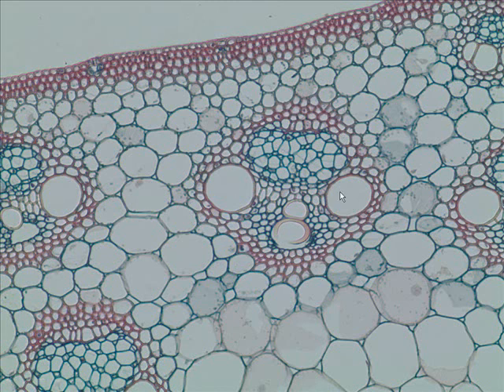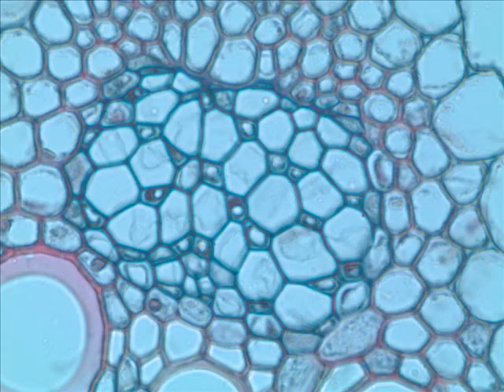Sclerenchyma. Then we have these two big guys. They are what type of cells? Xylem. We could say primary xylem, but monocot stems don't have secondary xylem, so we can just call it xylem, as opposed to this, which is what? Phloem. Xylem, phloem, surrounded by sclerenchyma tissue. Sclerenchyma fibers. And here we have our close and personal, looking at what?